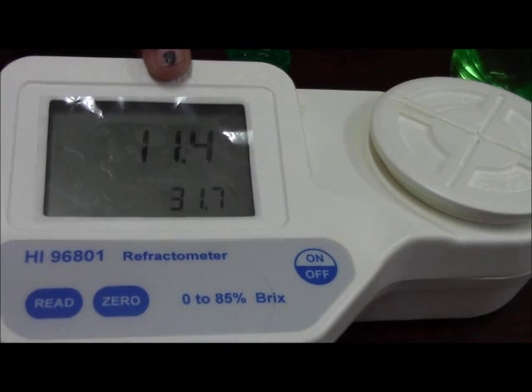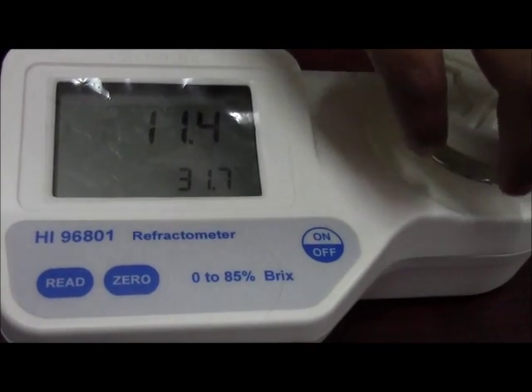It is showing 11.4 as the Brix percentage for 7up.